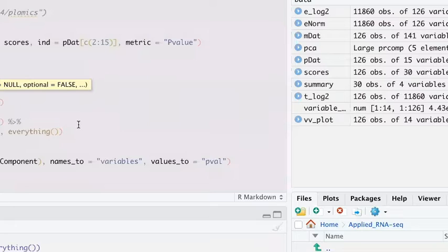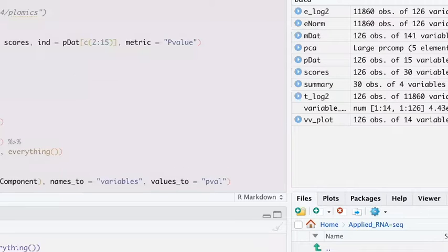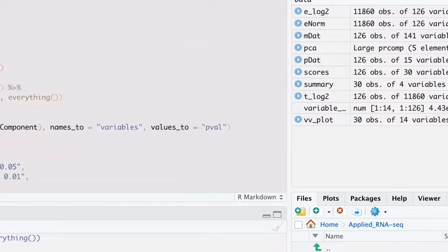Okay, I'll just slice this up because it should have done that before. Okay, so it should work now.